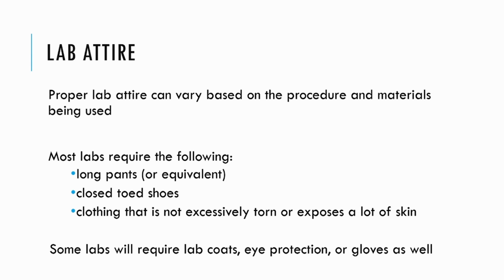Depending on what the lab is, or what procedures are being done, you may also have to wear a lab coat, eye protection, or gloves as well. It's important to know what you're doing in lab that day so you can come prepared. And if you have questions on lab attire, again, ask your instructor.